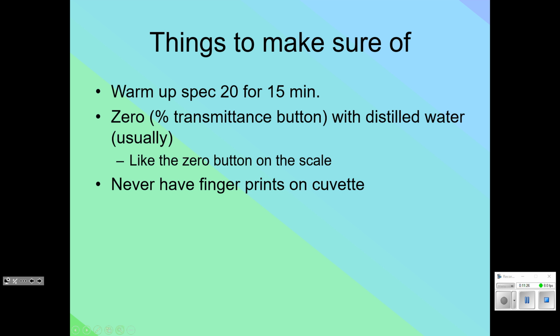I had one year, and it was at this lab bench, that someone, I don't know, just grabbing too hard, broke the glass. And then when that happens, now we have to try to get glass out of this. So I had to take it completely apart. And this is not the same machine anymore. Because once I took it apart, I don't know what happened. I was careful, but it's back there. It's our backup, because it was not giving us good data at times. So you got to be careful when you take it in and you pull it out. Heck, there was one time that a group left a solution in here at the end of the day, and then we put everything away. Ooh, we should not do that, because what happens if we spill that into this really expensive piece of machinery? Not good. So again, we got to take care with this, because it is a very precise thing.